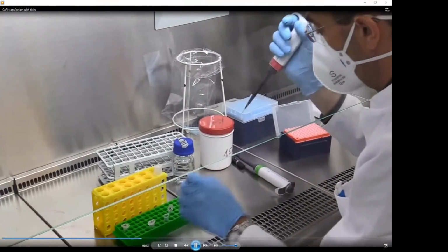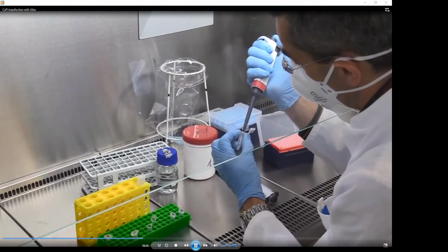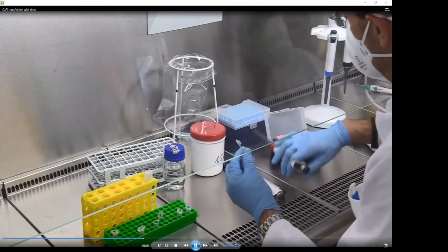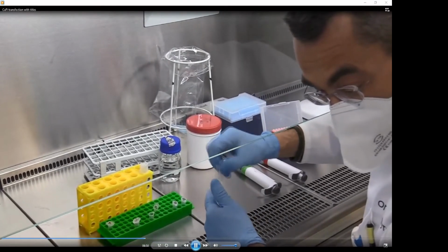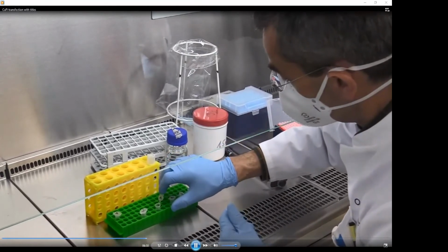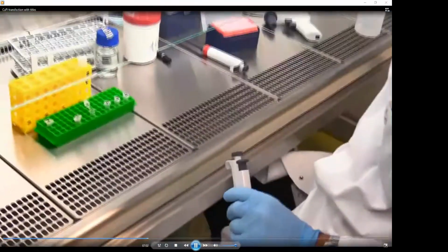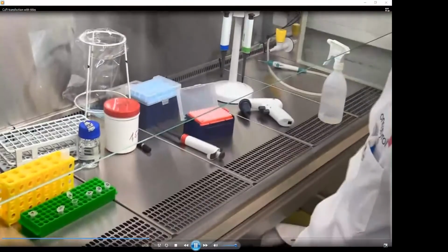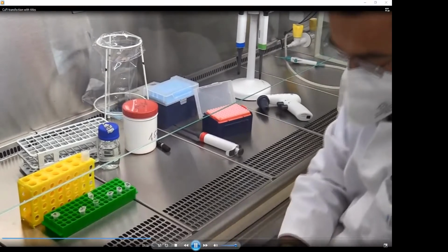And we tried it and empirically learned that the transfection efficiency has the same values, but the activity of the reporter is not affected when we use this pHMT for bacterial expression of proteins. So that was the sample, B1. And then you add calcium chloride to this mixture of water and DNA.